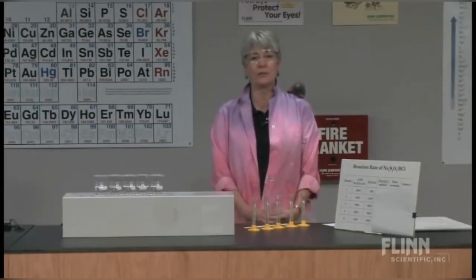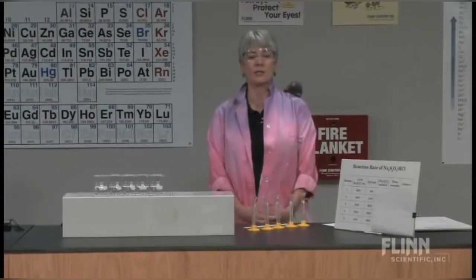It can be done on the overhead projector and all the students can gather data together, or you can have them do it back in the laboratory. It's a clock reaction essentially.